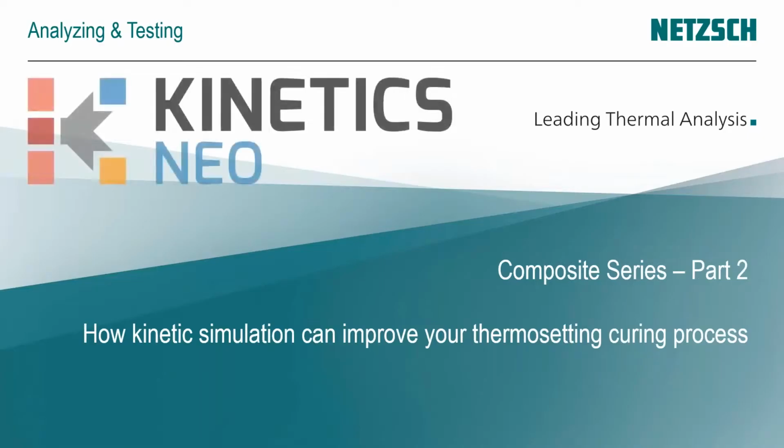So today we are dealing with kinetic simulations on thermosetting during a thermosetting curing process. Today we will continue with our Composite webinar series. Part 1 took place at the end of November last year, and Part 2 is today, dealing with kinetic simulations, especially with the use of Kinetics NEO and how Kinetics NEO can improve your process.